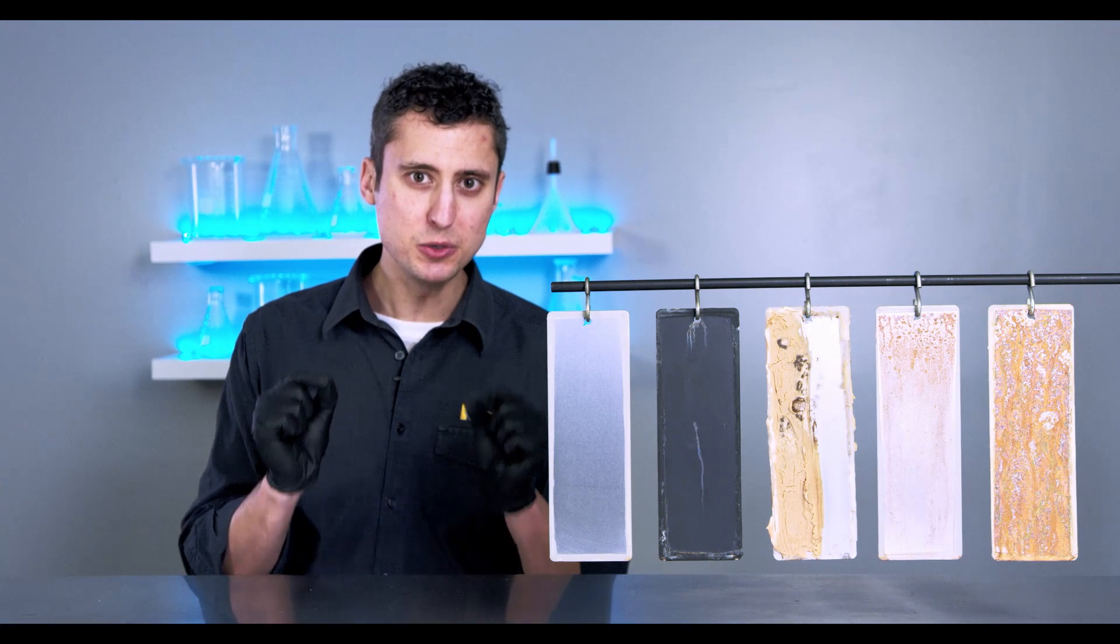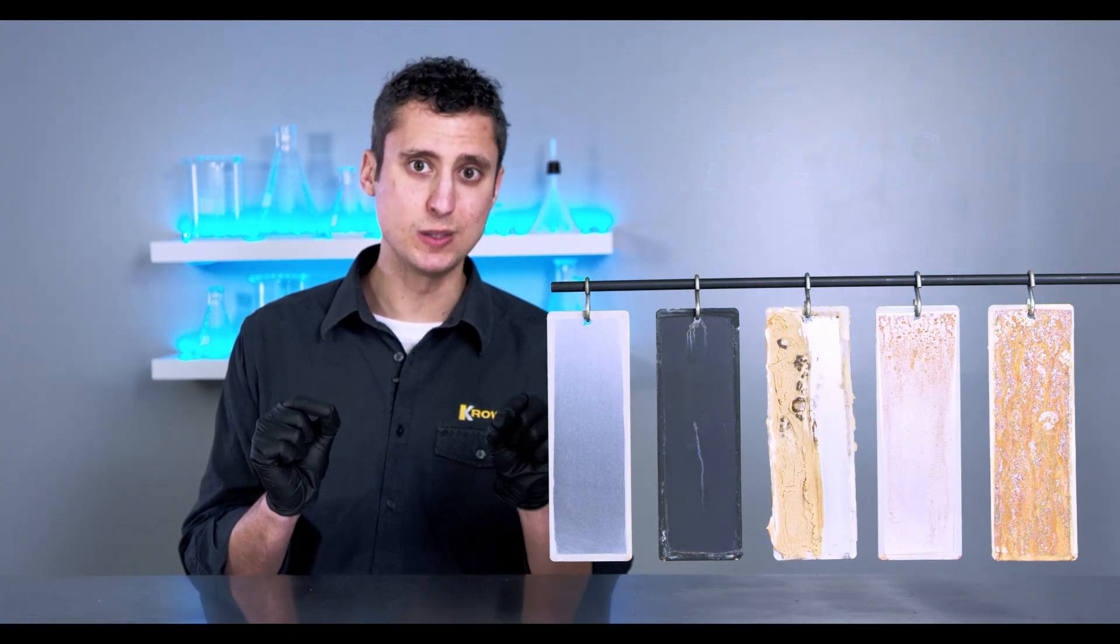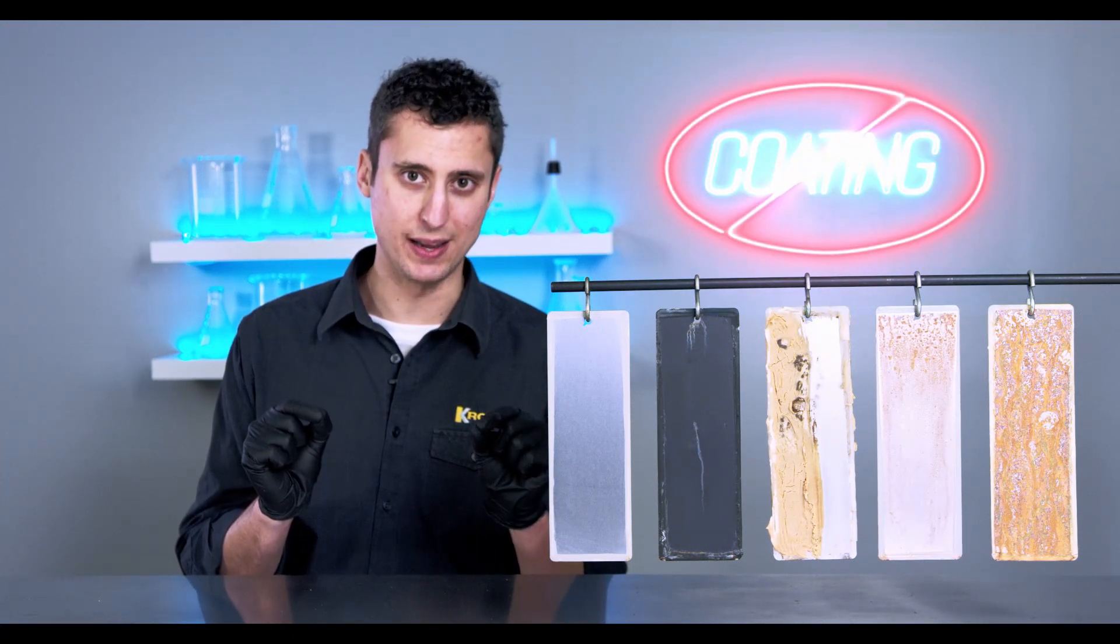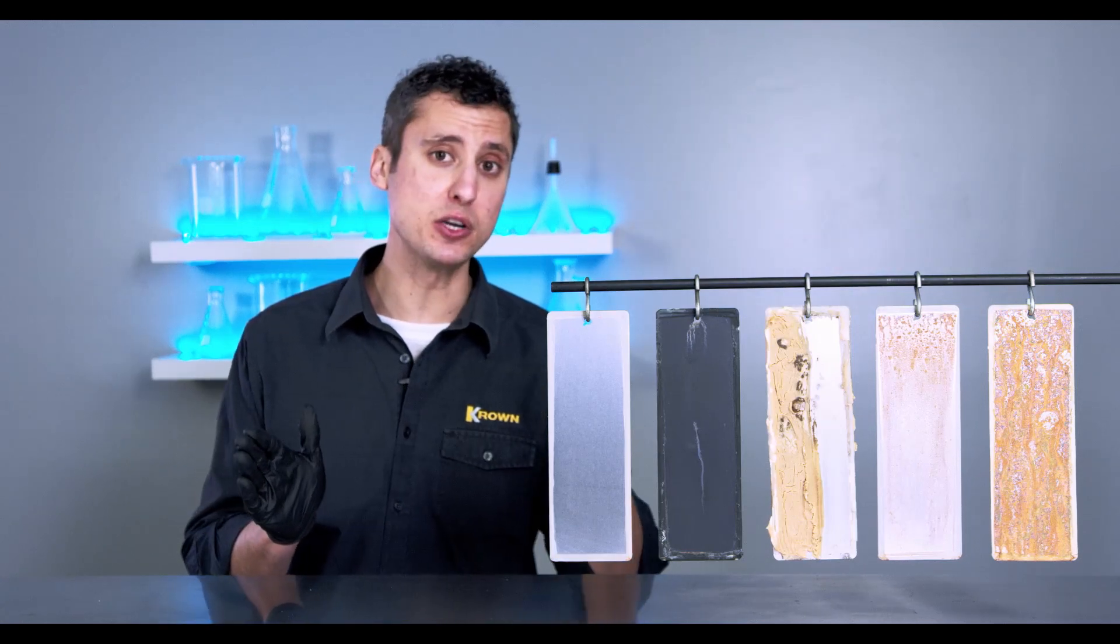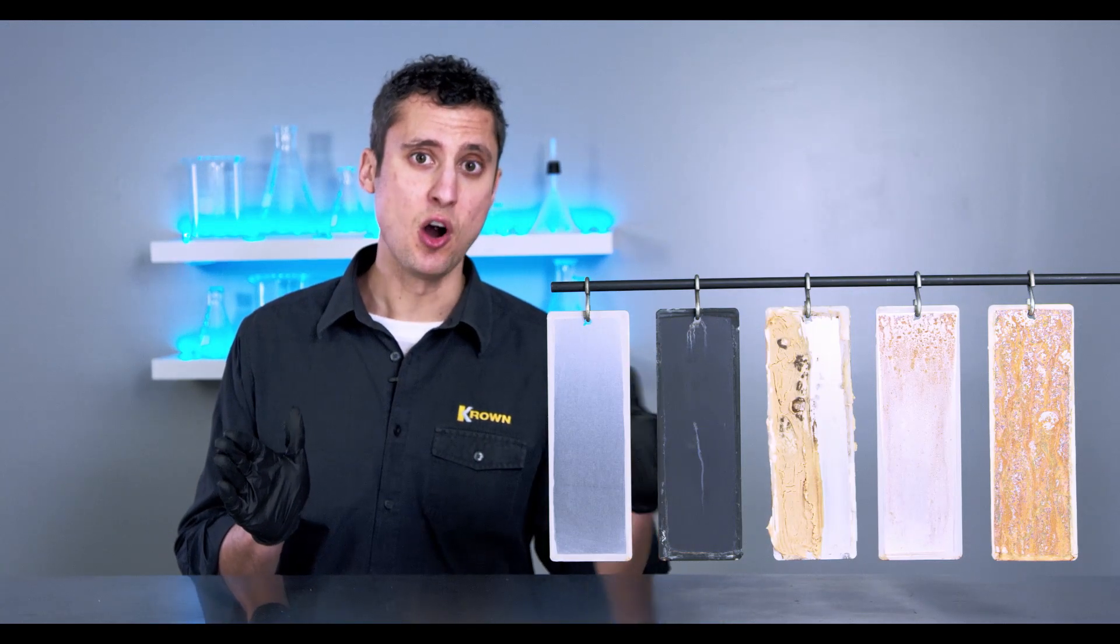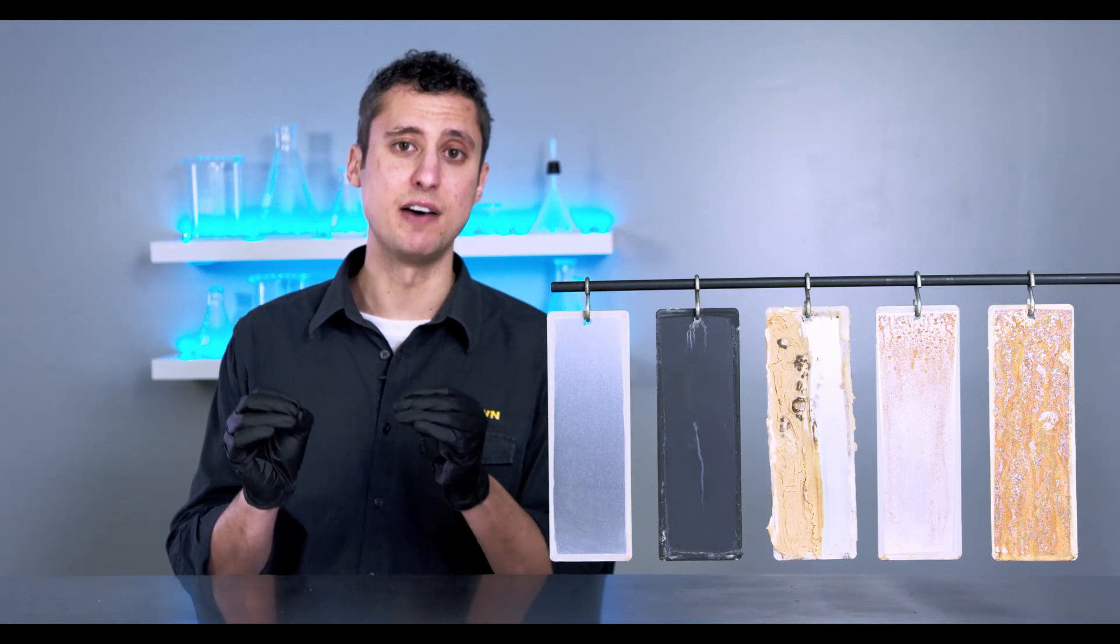But something you should know is the fact that Crown is not a coating. The salt spray cabinet test, as well as many other YouTube videos you may have seen, are measuring the effectiveness of a coating.